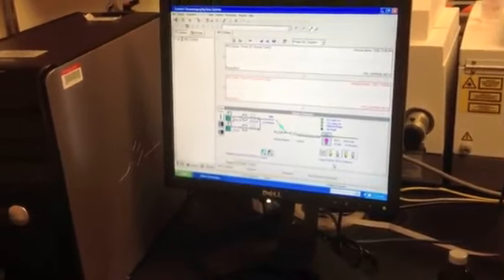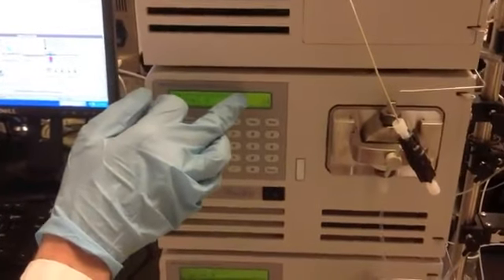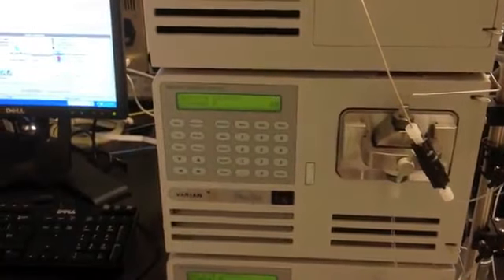Once you've pressed Start, it's going to send over the method and the machine is actually going to start pumping. You have to keep an eye on the pounds per square inch. That'll start going up pretty quickly.